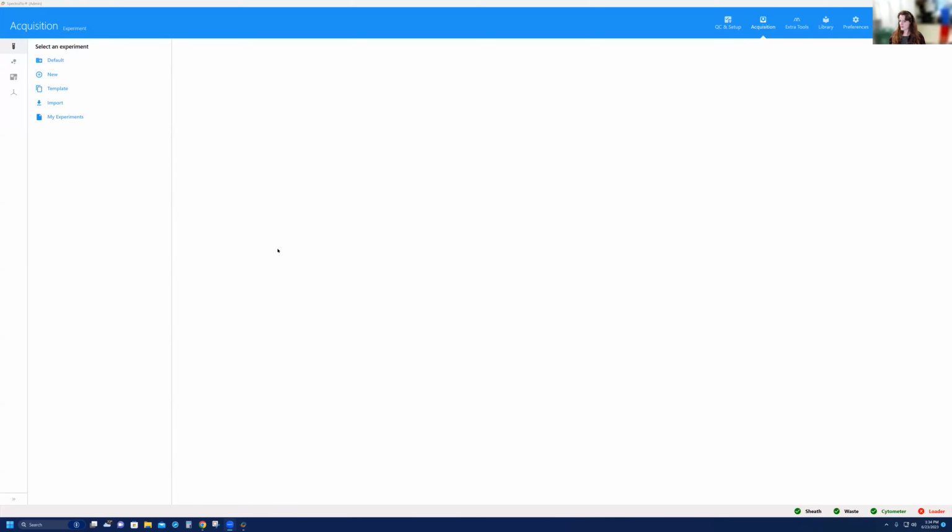So we're now at the Aurora and we have an understanding of the experiment that we're about to run, thanks to Derek just giving us the outline. I'm in front of the instrument, sharing the screen, and what you see is that we're signed in. This is the home screen that we're going to see on the Aurora. I'm going to go over the basics of setting up an experiment, but I might not go into really minute details because we do have prior sessions on setting up an experiment and troubleshooting experiments in the Aurora on our YouTube channel, but we'll still get an idea of how everything is working.